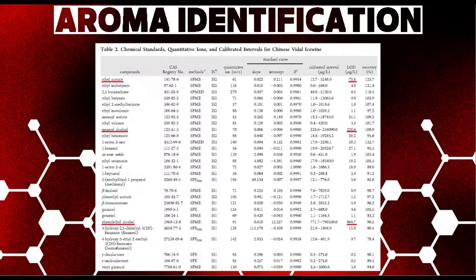The internal standards used to quantitate the compounds were IS1, L-menthol, IS2, octyl propionate, and IS3, p-fluorobenzaldehyde.